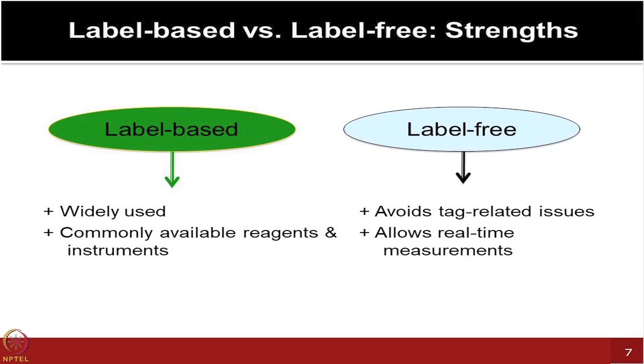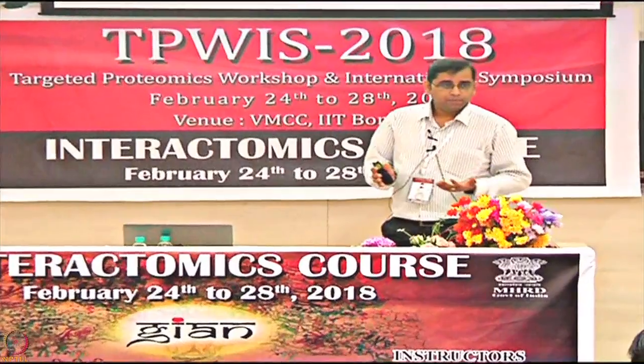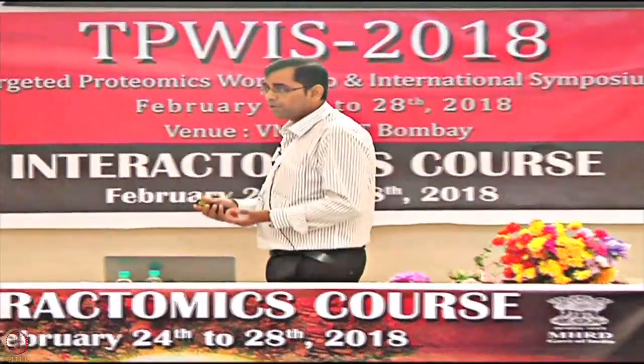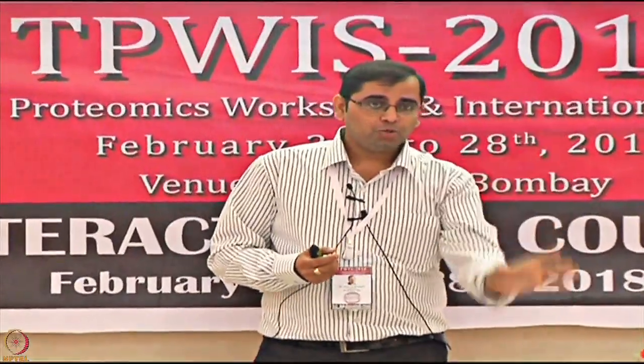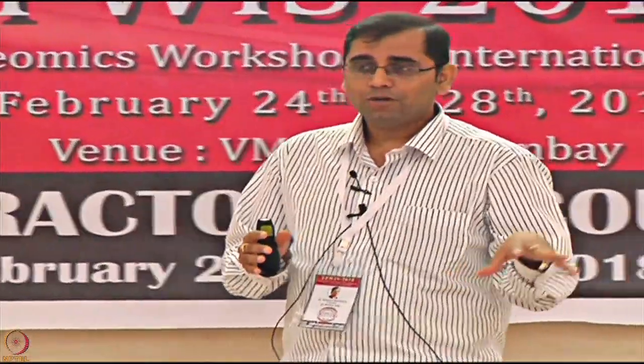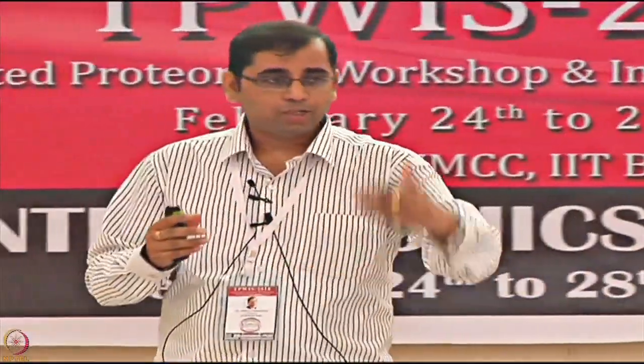And most importantly, you are actually monitoring the biomolecular interactions in a real time manner, and that is pretty powerful, because all the protein microarray technologies are great, but it takes the whole day to do the experiment, sometimes even longer if you are doing blocking and all, and at the end of the day only then are you relying on the scanner to show you whether your spots are lighting up or not, or you see some sort of huge background, you see your controls did not work out, and you are hugely disappointed. But you had literally no control as the experiment progressed the whole day.